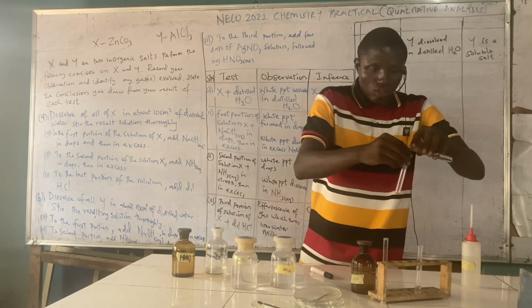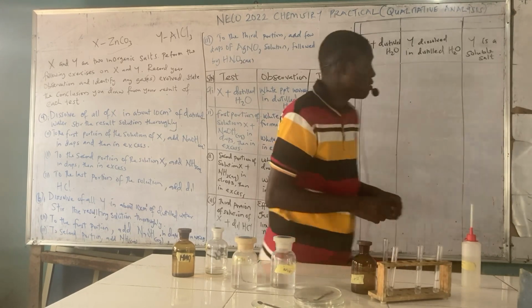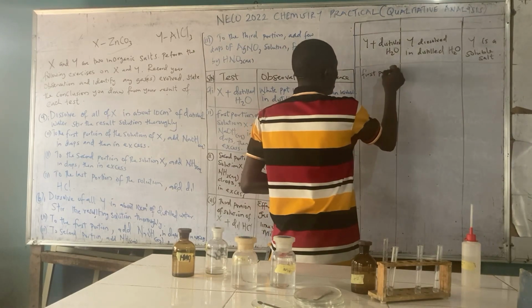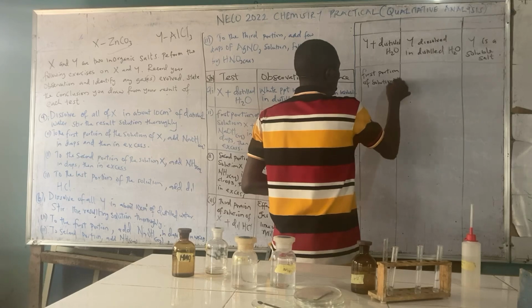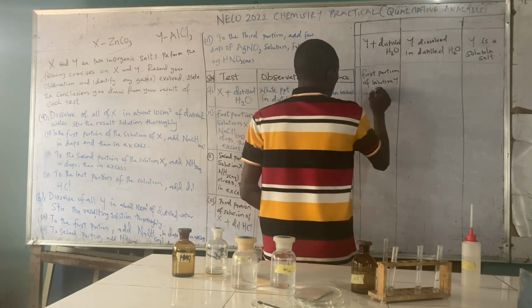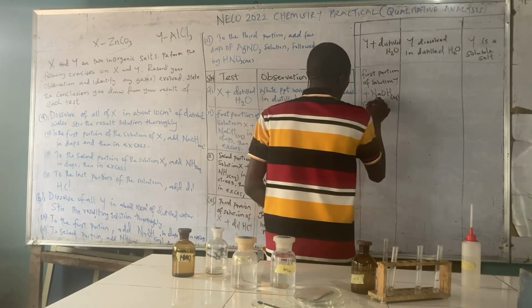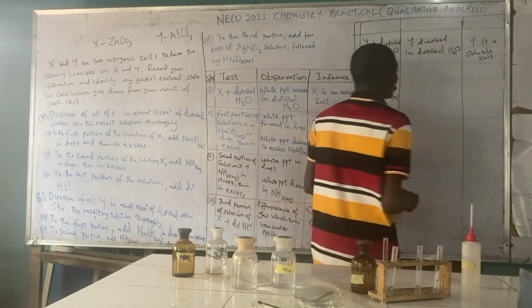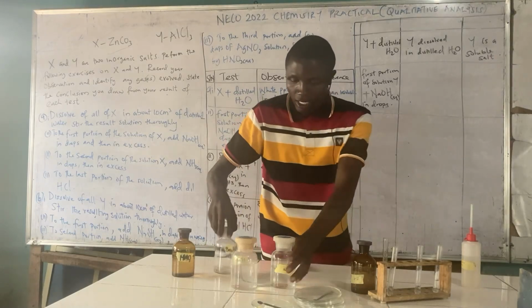Now to the first portion of solution Y, we add aqueous sodium hydroxide in drops.